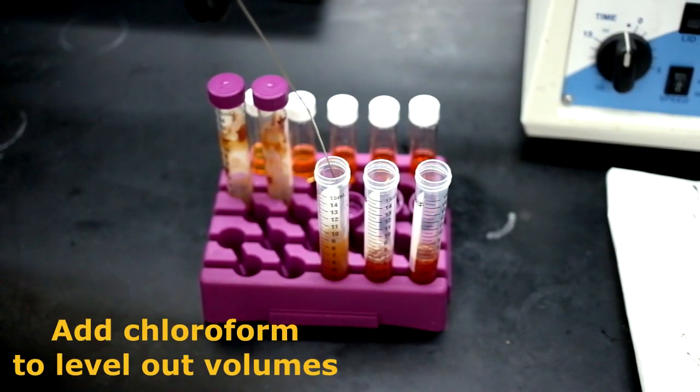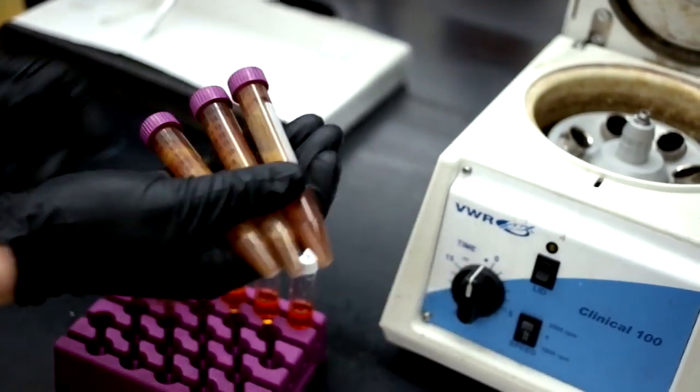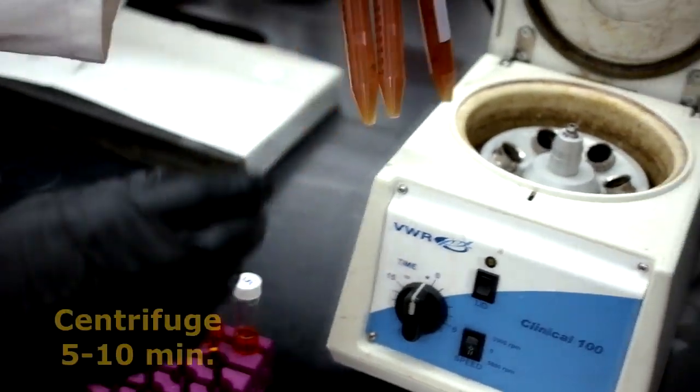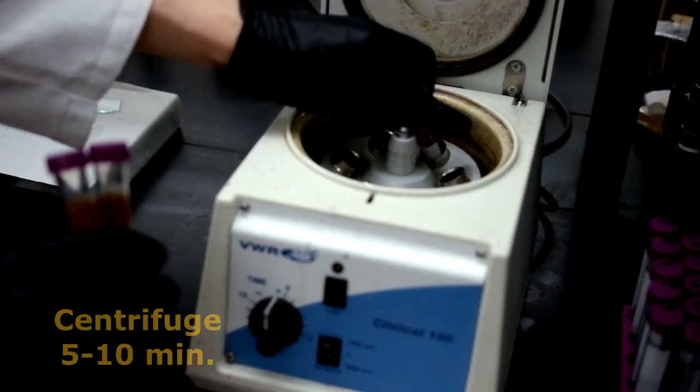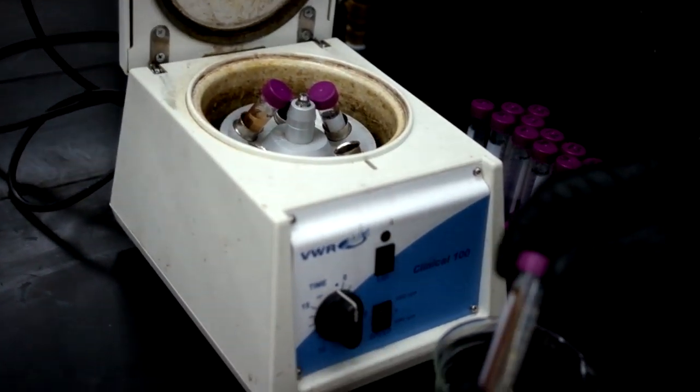Add chloroform to each of the test tubes until you have an equal volume in each. Shake to ensure the material is mixed properly and centrifuge for several minutes. You will notice that the precipitates have gathered on one side and a clear liquid remains.